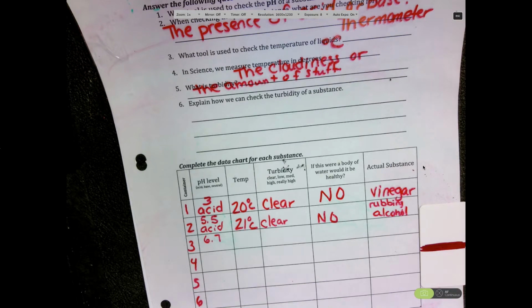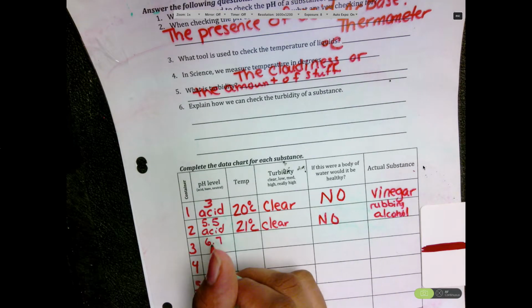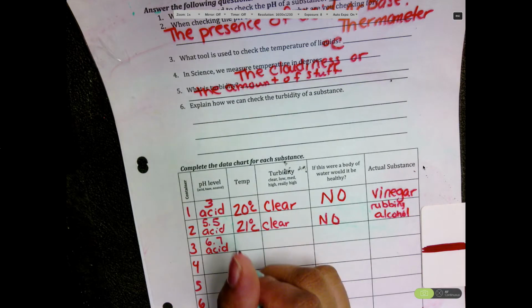What's neutral? 7. 7 is neutral. Read your notes, Duran. So this is an acid. Anything below a 7 is an acid. The temperature is 22 degrees Celsius.